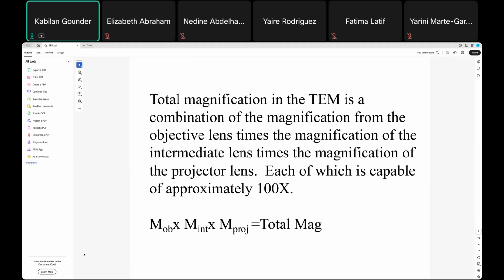So if you wanted to get the same detail as the healthy one, maybe for the cancer cells you can go for 400,000 times instead of 300,000 times. Now you can see the same size. So it does not mean that both are the same.